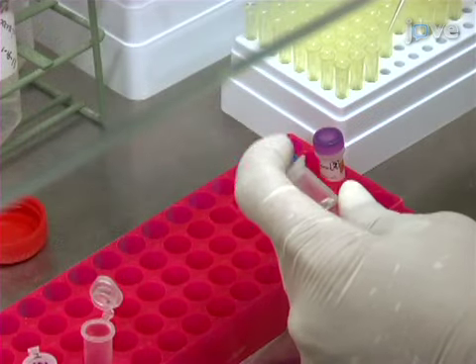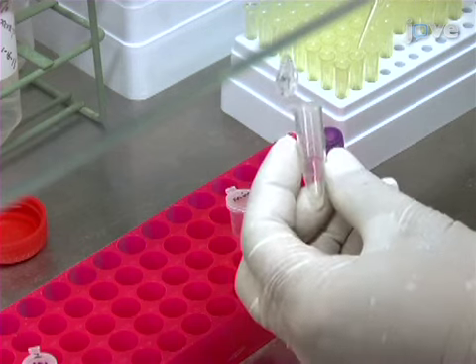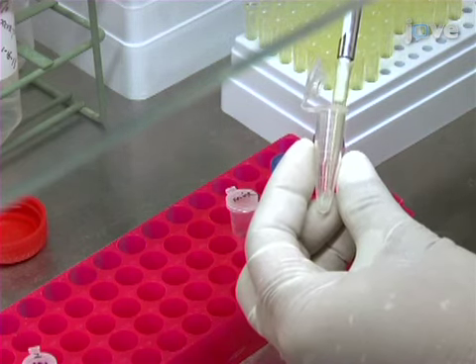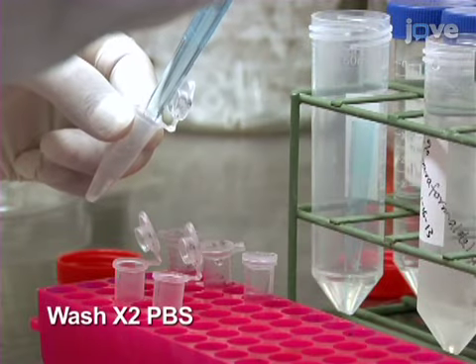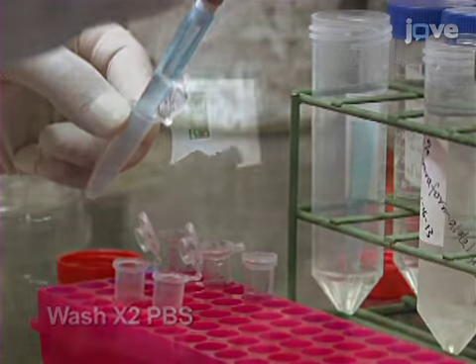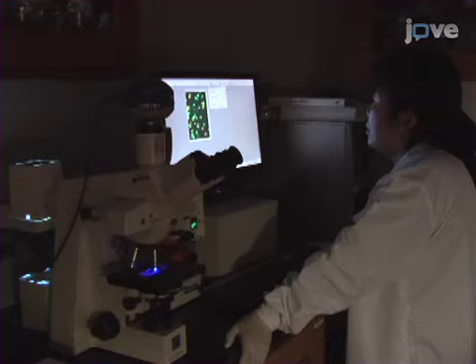After fixing and permeabilization of cells, add TUNEL reagent and incubate the cells for 1 hour at 37 degrees Celsius. Following the incubation, rinse the cells twice with PBS. Then, determine the percentage of stained cells by epifluorescence on a computer-controlled microscopy system.